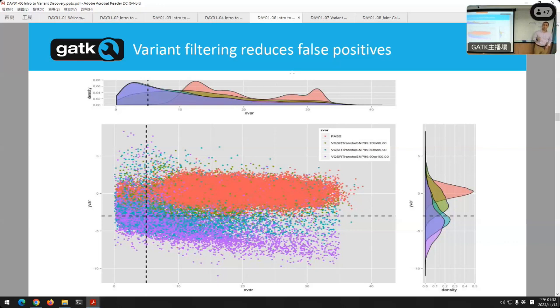So there's always filtering of the variants that we do downstream. After we do this joint calling and see all the data together, we can say, look, this thing looks low quality in this sample, but high quality in that sample. So maybe it's fine, it just wasn't sequenced well in this one. But if this variant is low quality in all 100 of these samples, that's probably an error. It's probably a mistake in the sequencing, not a real mutation. Okay, and so we'll show you examples. Tomorrow we'll talk all about filtering, and there's a lot of machine learning that we do now for this. It's a very, very good project for machine learning.